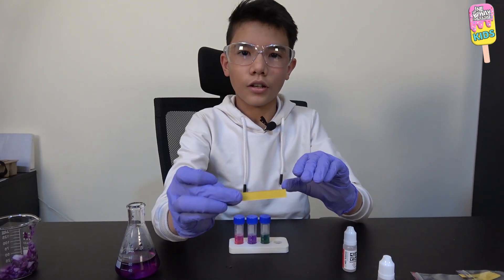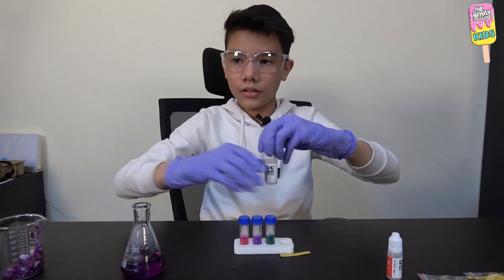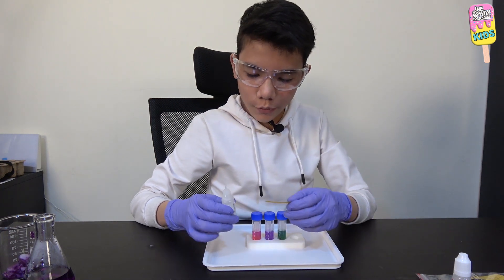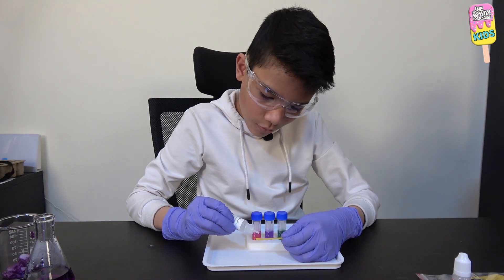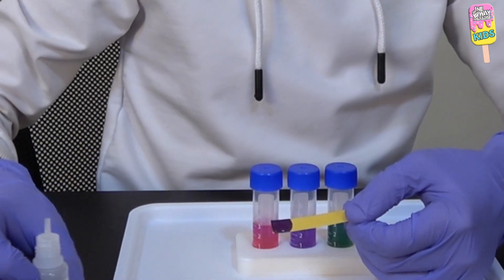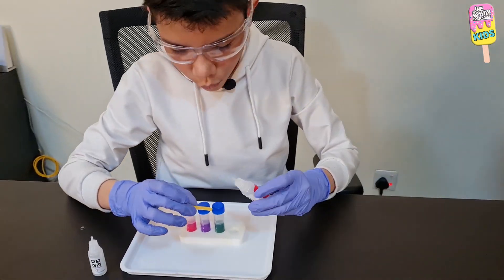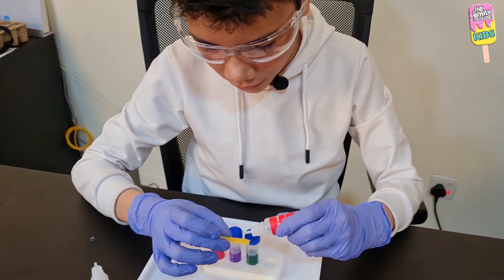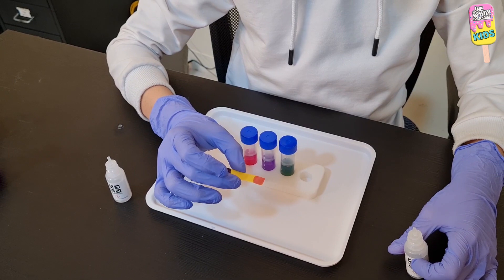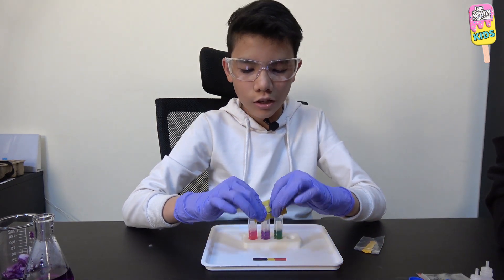I took a pH indicator strip and I'm going to drip some sodium carbonate on one end of the strip — I forgot the plastic tray, anyway. Then some citric acid on the other side. One drop of citric acid on one end. Bismillah. And that turns a pinkish red.